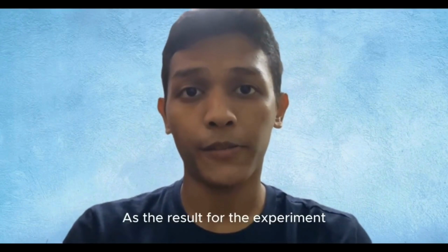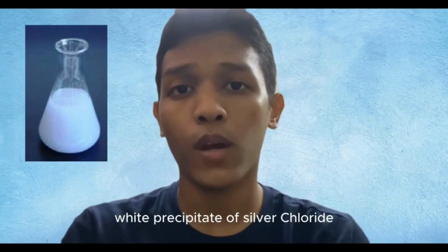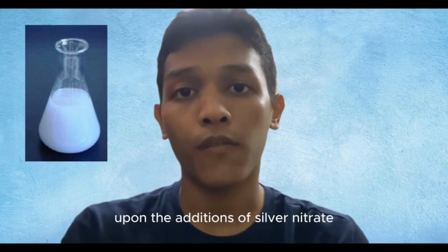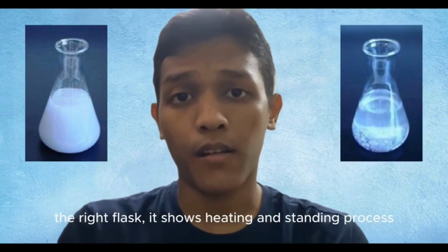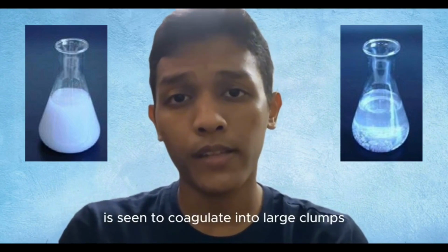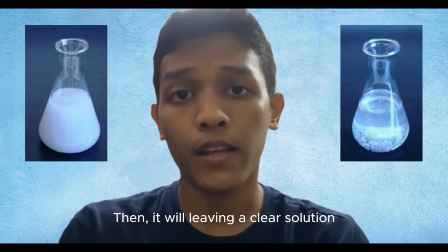As the result for the experiment, firstly, the left flask showed a cloudy white precipitate of silver chloride that forms upon the addition of silver nitrate to the chloride sample solutions. Next, the right flask shows the heating and standing process. The silver chloride precipitate is seen to coagulate into large clumps, then leaving a clear solution.